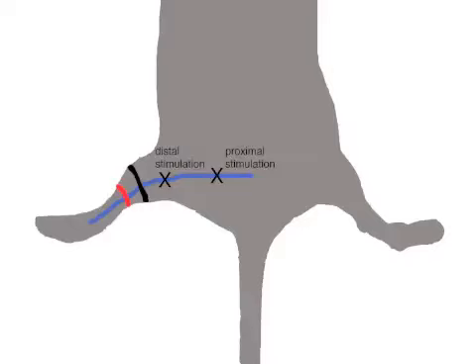The place of proximal stimulation is at a distance of 16 mm from the sensing electrode. This means that we have a gap of exactly 12 mm between the points of proximal and distal stimulation of the sciatic nerve.